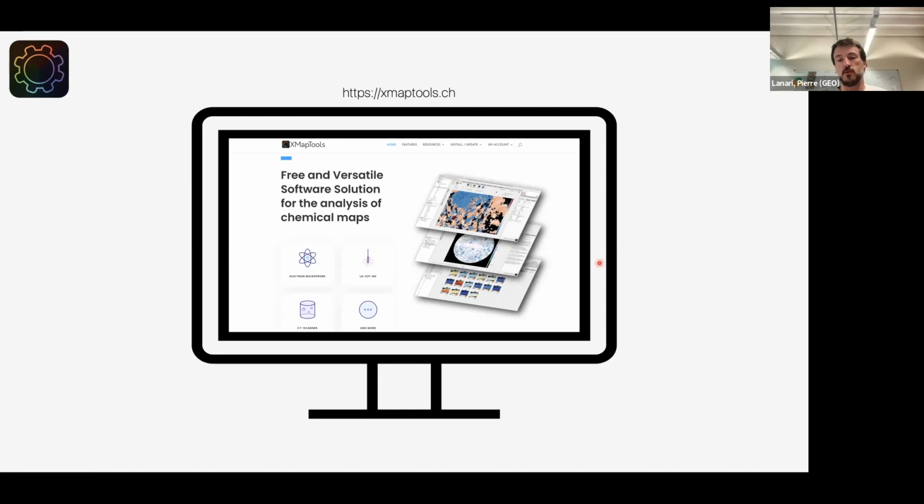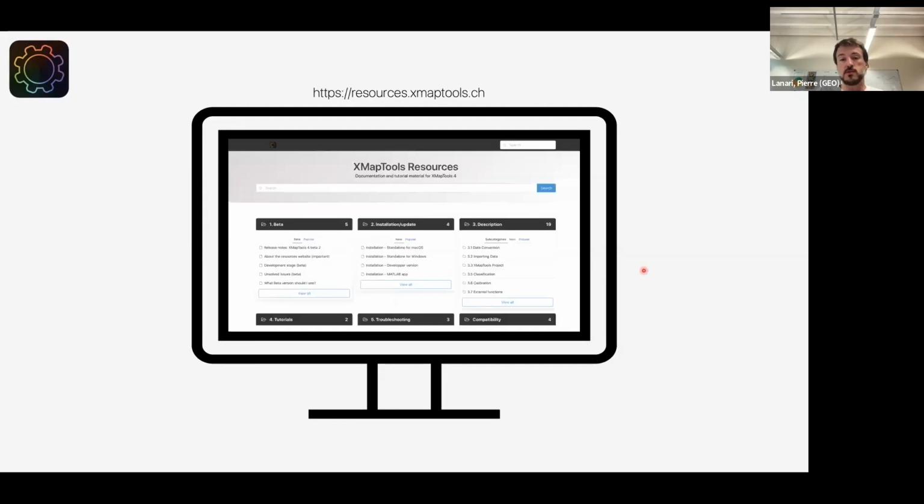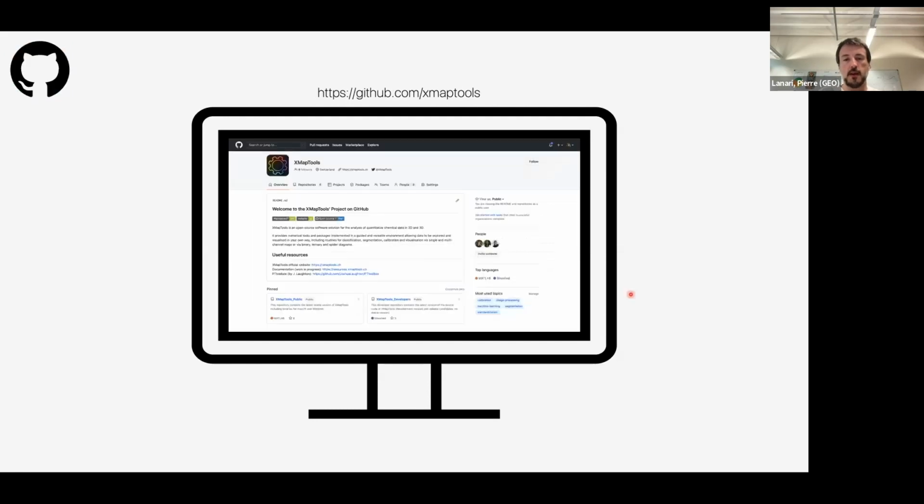And my philosophy has always been that if there is an error, I'll communicate openly on the error, and I will contact you and say, oh, here there was an error for some time. Unfortunately, those things happen. We have the resources website that contains some description of the different parts of the program and tutorials. This is something I'm working on. It takes a lot of time to develop and to build. And this is not completely up to date, but we are getting there.